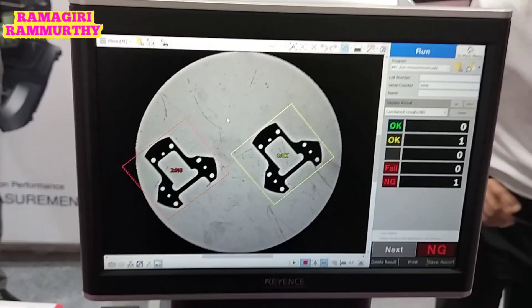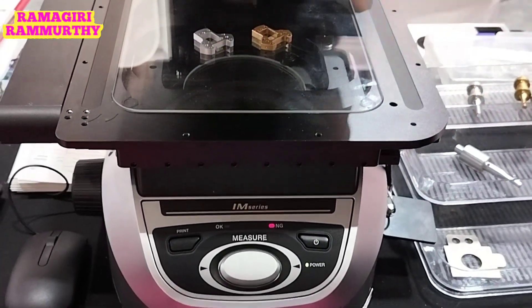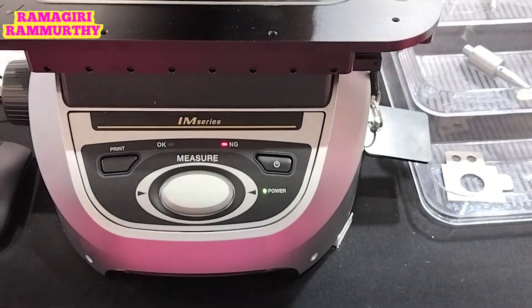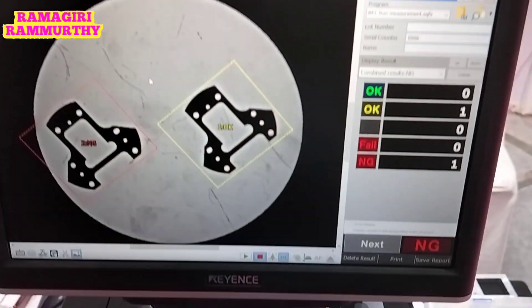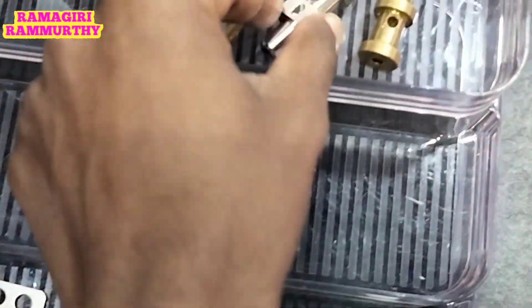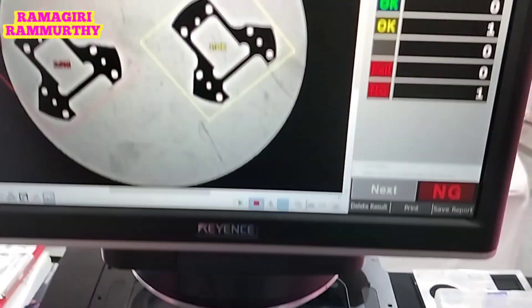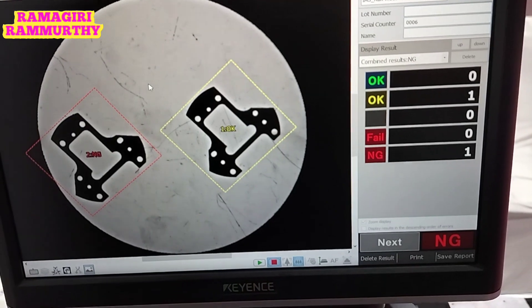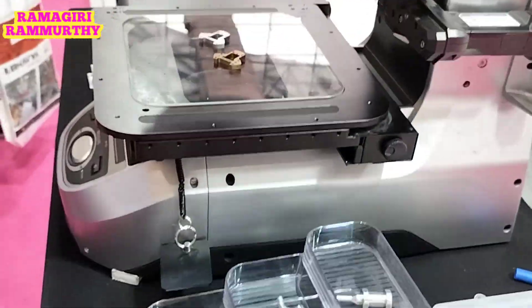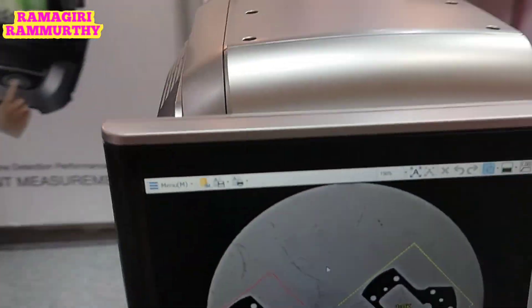Which industry is this used in? This is used in the aerospace industry and automotive industry, and many industries wherever dimensional inspection is needed. We can see the particles, check the status, and assess damage and condition.